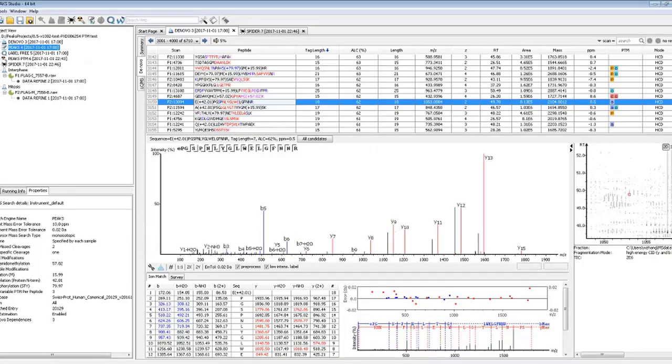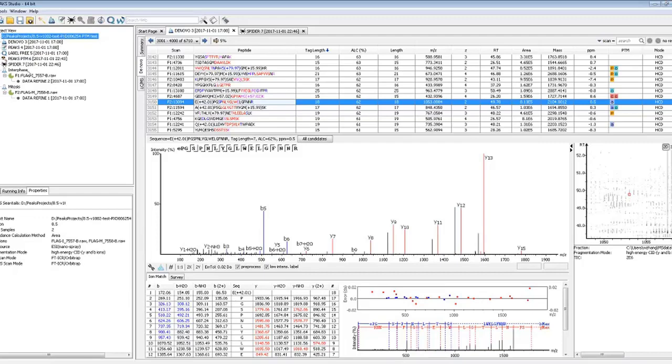The reason why I talked about all of that information together is because when you actually do a search in PEAKS, the PEAKS DB, PEAKS PTM, and SPIDER search results, and even Denovo sequencing can all be set up from the same search space. So in this example, we have a project where we're just considering 2 data files.